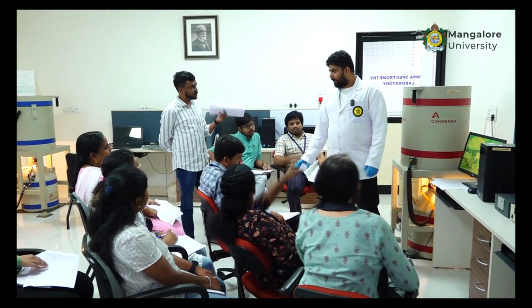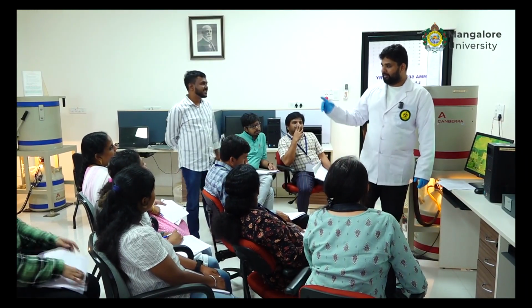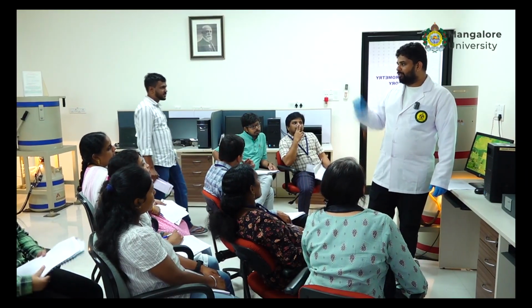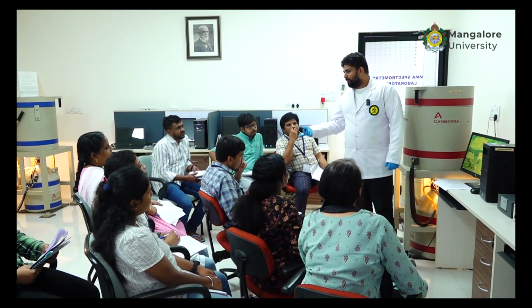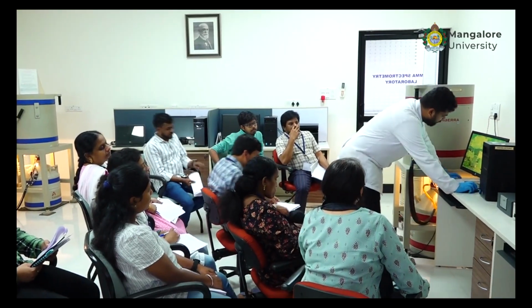No, plastic. Then it is fine, because if you use glass bottles, then K40. Not only K40, I think some glass bottles, or the older ones, can have traces of uranium. And silicon, some silicon may contain thorium. So those issues are there. So plastic, it's not a big issue.